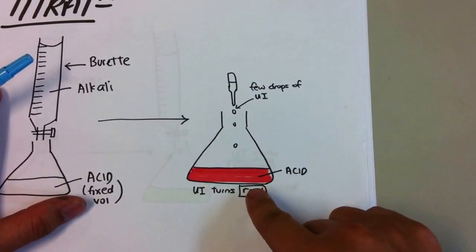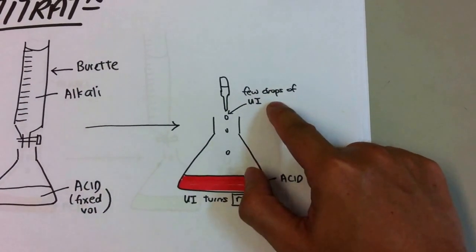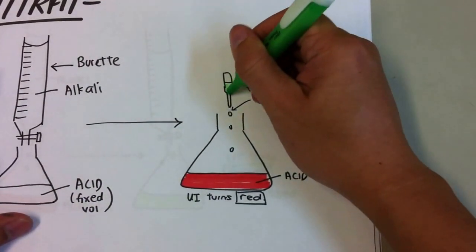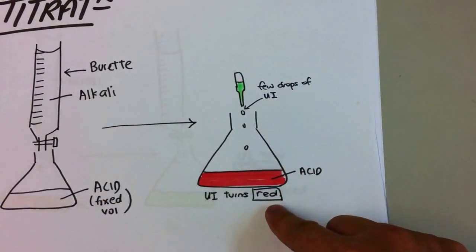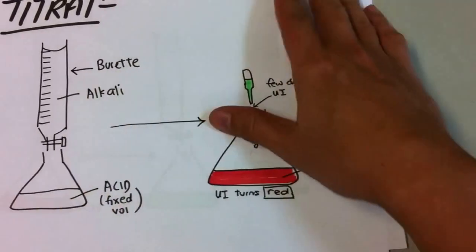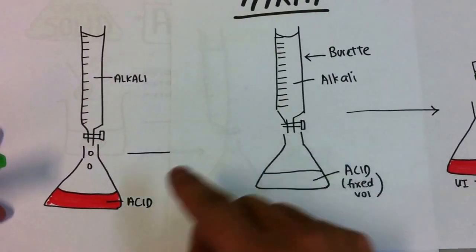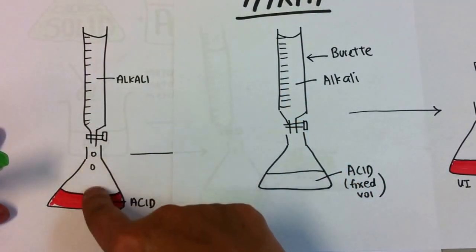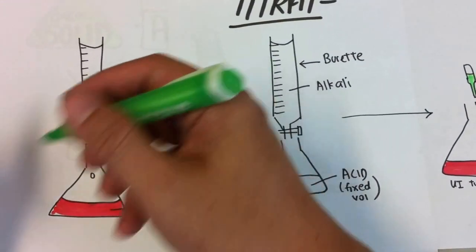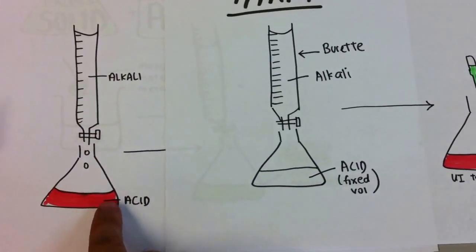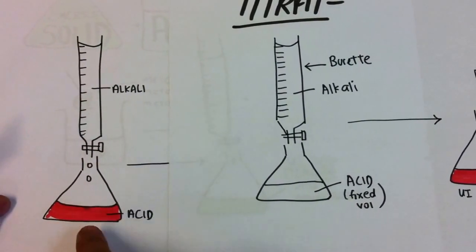Universal indicator turns red in acid. Its original color when it is neutral and water is green. So remember, it is green. Original color. When it is neutral, it is green. But when you add it to acid, it will turn red. So now, this is what I have. I have acid. The indicator red. So when I add alkaline in and drops of alkaline goes in, the part that touches will turn green. But because there are so much acid there, when I swirl, the acid will dominate and the whole solution will be acidic because not all the acid is used up.